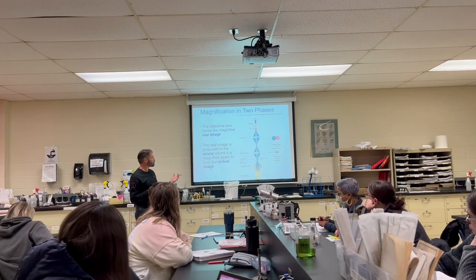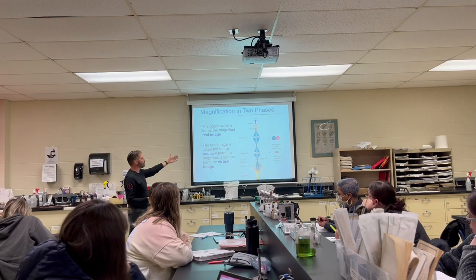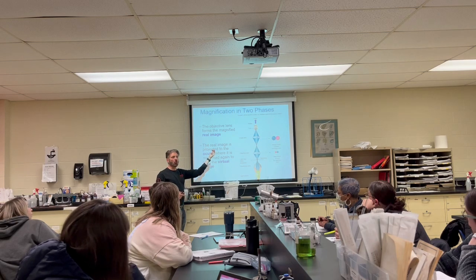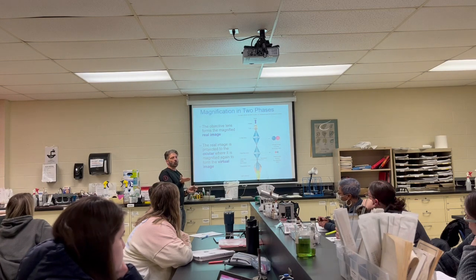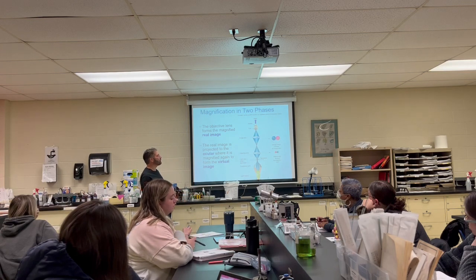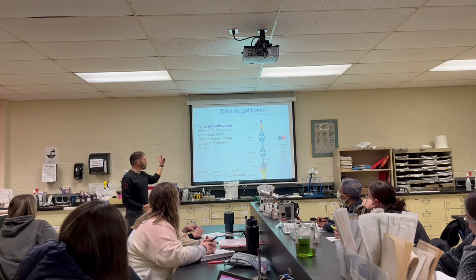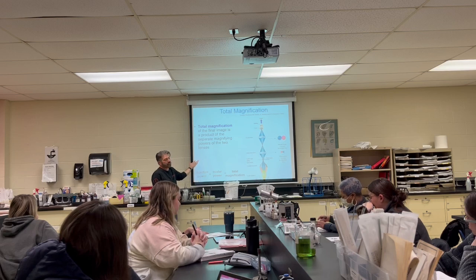Your real image is projected into the ocular, where it's magnified into a virtual image. So just realize your image gets flipped. When you go to do your lab, it's going to say, if I move the stage right, what do you think happens to your image? It moves left. You move the stage away, the image moves towards you. So if they ask you a question like that, you should know that. Or if you forgot, we're just going to go over it again. Total magnification again, if they ever ask you, I like to go ocular times objective, doesn't matter.